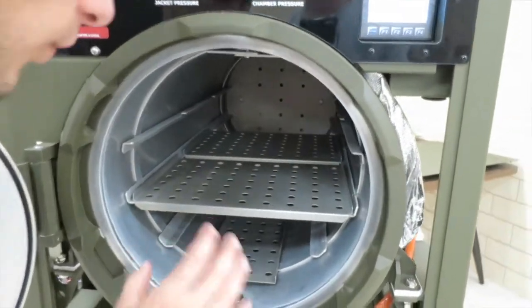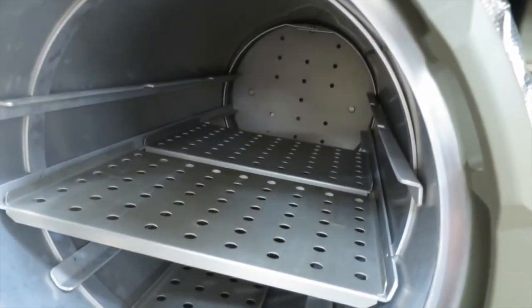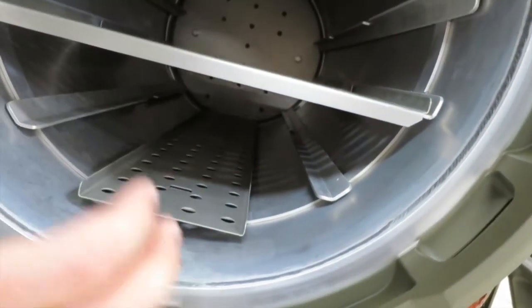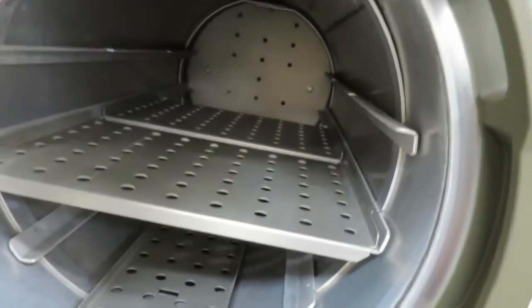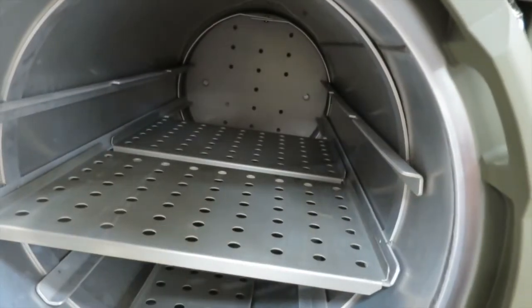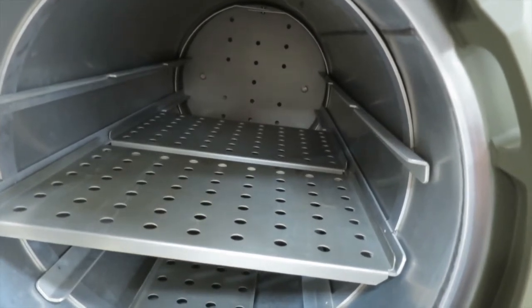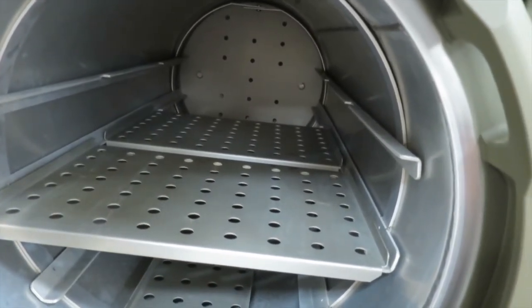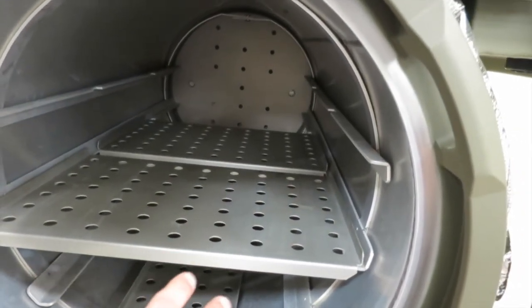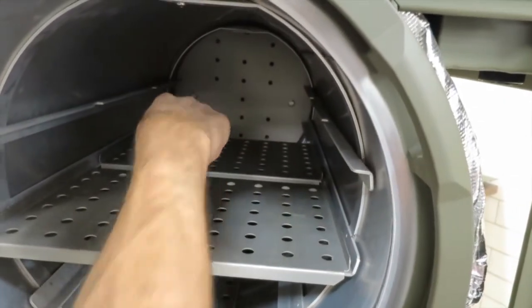Now, when you're listening close here to the chamber, you will be able to hear a boil in the jacket. So it's very easy to mistake the boil for the sizzling. The sizzling is pretty constant, and you're going to hear a tss, tss, tss. The boiling is just a bubbling noise. So there's a little distinction between the boiling in the jacket of the water and steam and the sizzle of condensation dripping in the back.